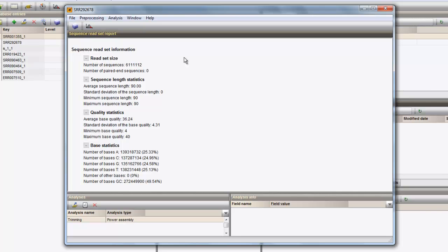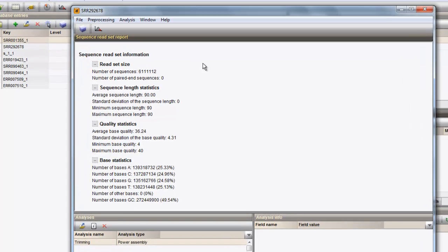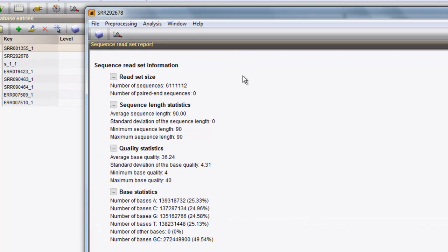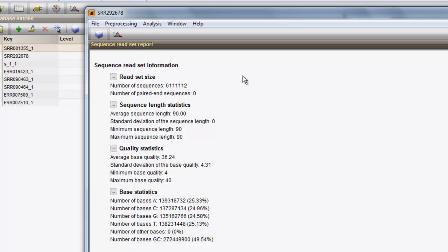For this dataset, we can see that over 6 million single-end reads were imported, all having a read length of 90 base pairs. The average base quality was calculated as 36.24, and base qualities vary between 4 and 40.